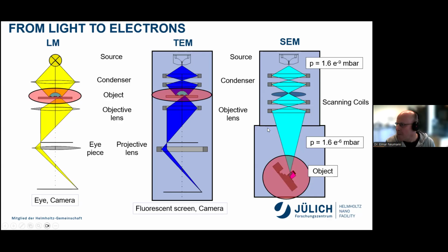So why go from TEM to SEM, losing again a bit of resolution, is the fact that it's very difficult to image surfaces with transmission electron microscopy. It is in principle possible, but you have to make great preparatory efforts in order to do this.